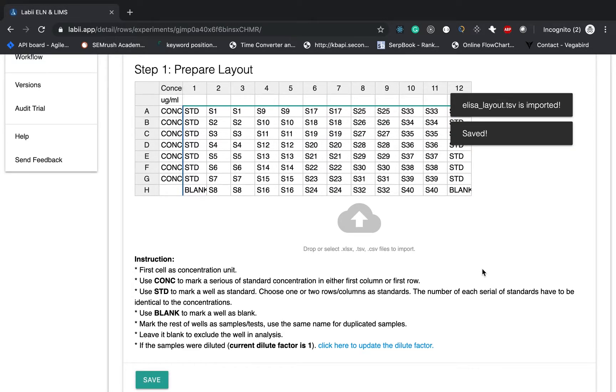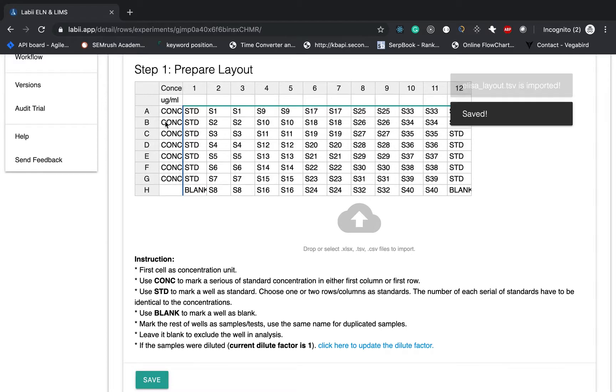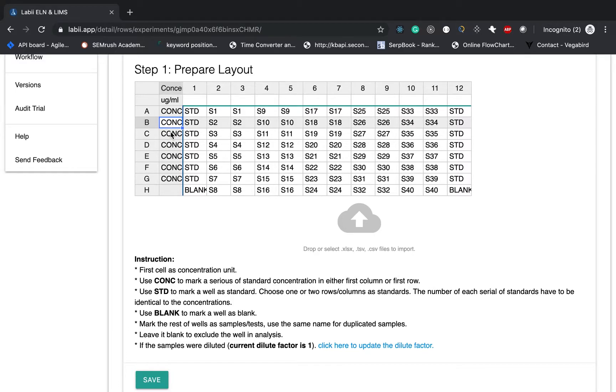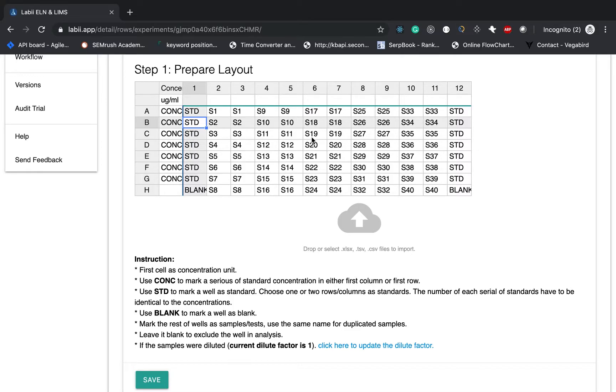Just a few things to mention. Put the first cell as your concentration unit. Using the CONC to mark the series of the standard concentration in either the first column or the first row. Using STD to mark the standard. You can choose more than one column or the rows. Using the blank to mark a cell as a blank.